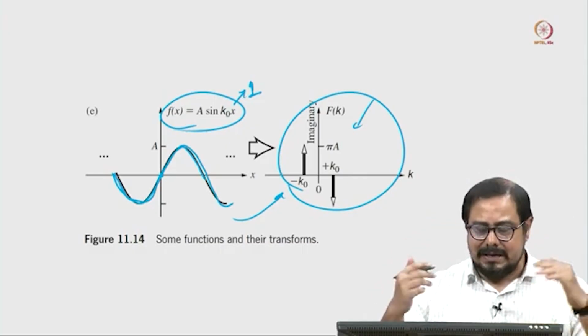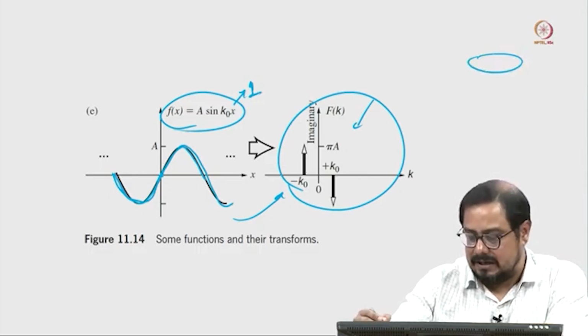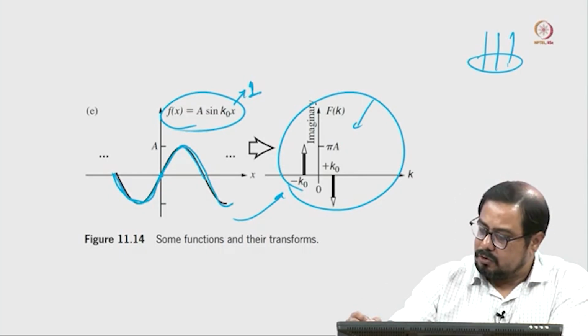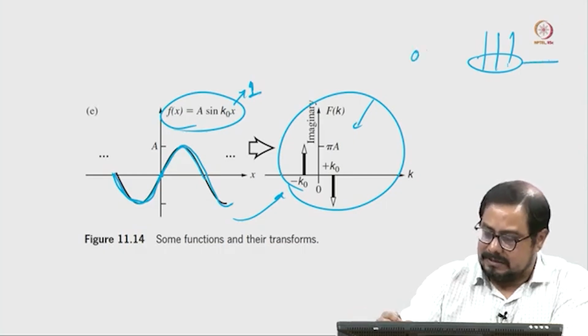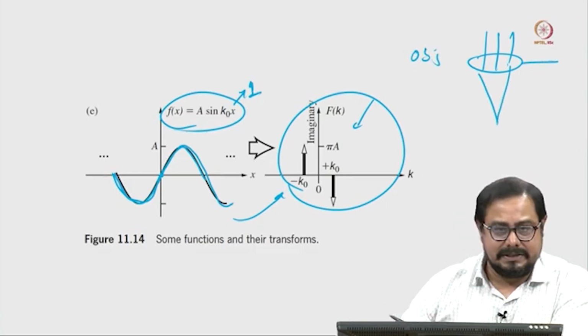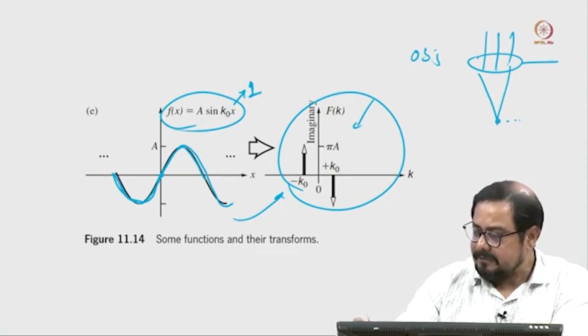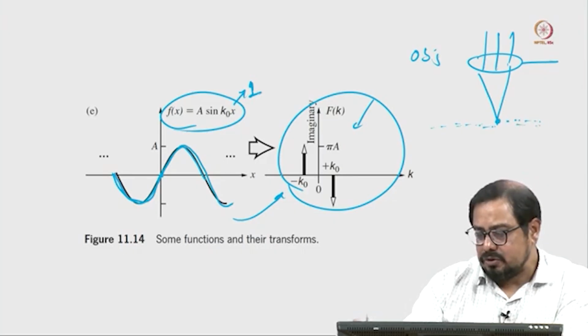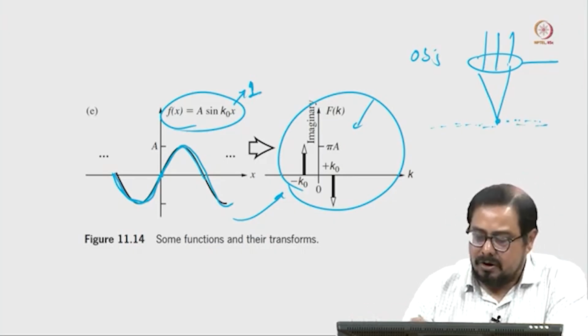So, there is a relationship. If we have a sample here, the electron beam will come here. If we consider that this is the objective lens, then we are getting some kind of images here, and we are getting the diffraction pattern here. When we are getting those dots, it depends on the frequency.